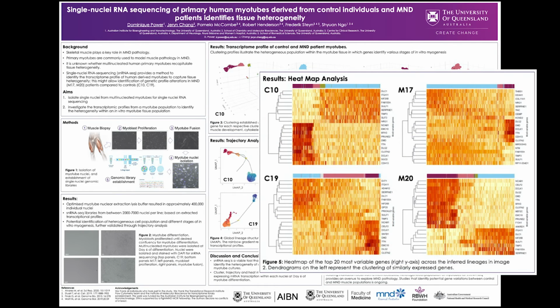Moreover, the heat map analysis enables a look at how gene expression changes through pseudotime. Genes with a high expression variability can be identified in the heat map, signified in yellow to red. Overall, this heat map parallels the marker gene analysis done for the clusters.